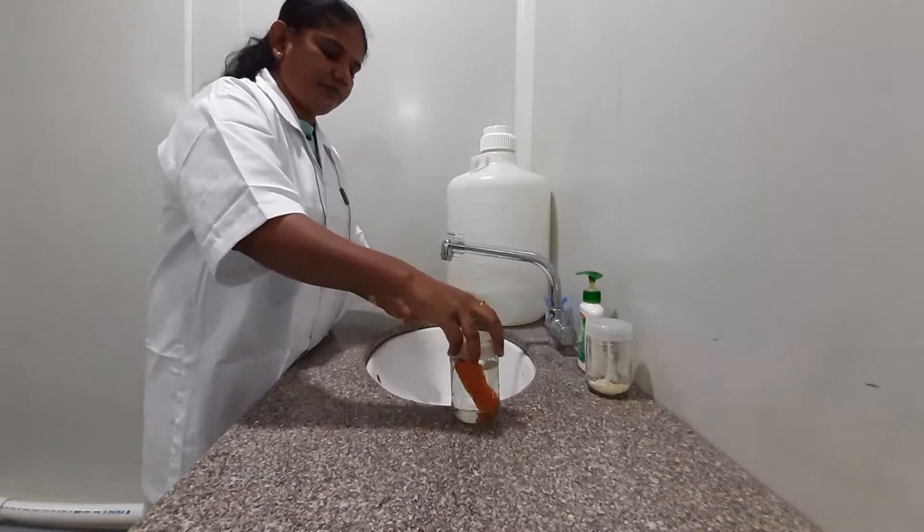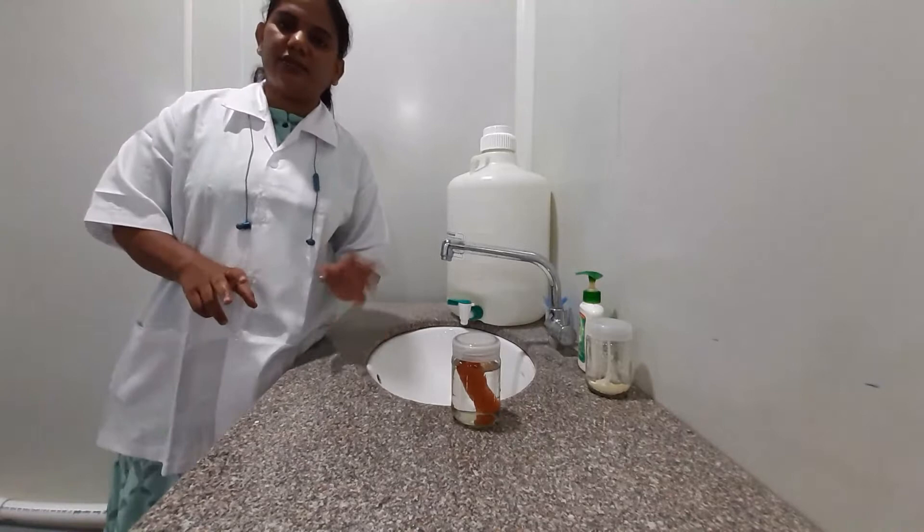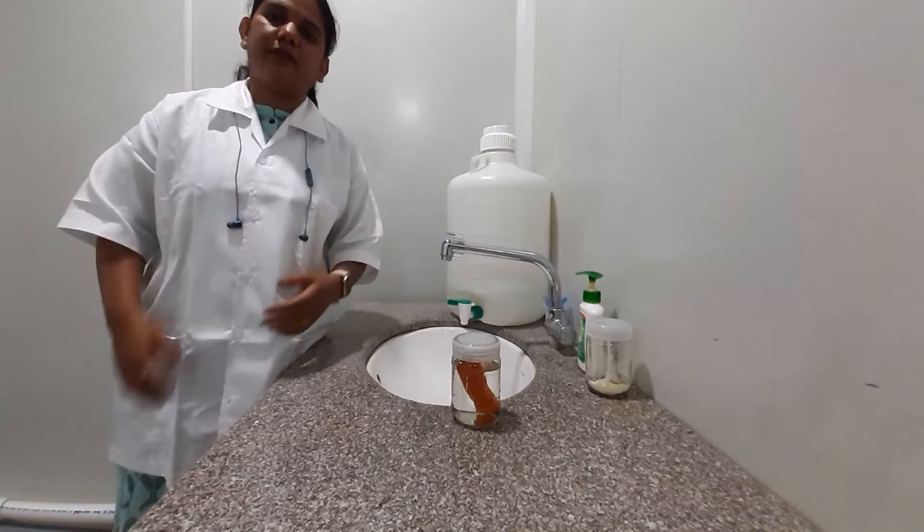Next, surface sterilization treatment will be carried out with the help of two chemicals: sodium hypochlorite and mercury chloride. This will be carried out in the laminar air flow.